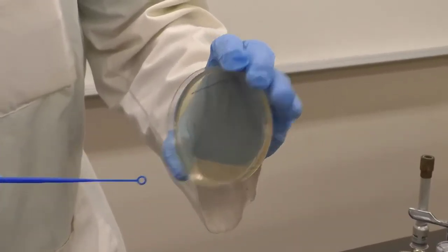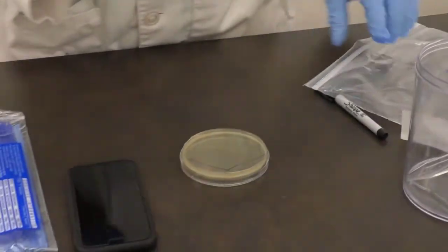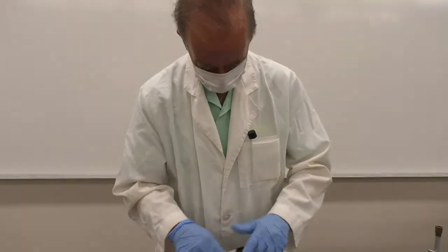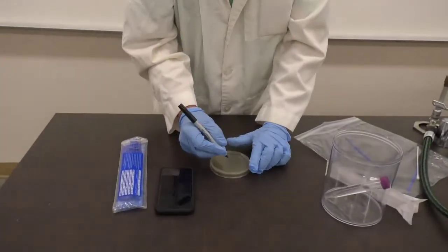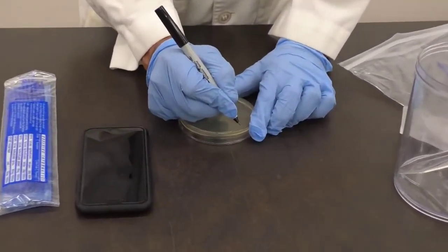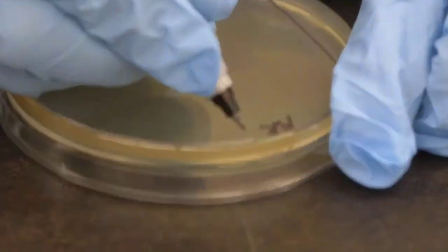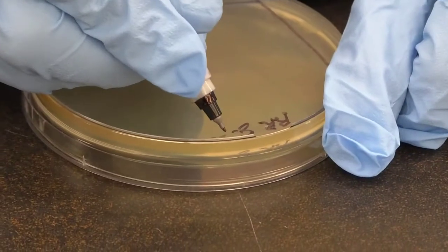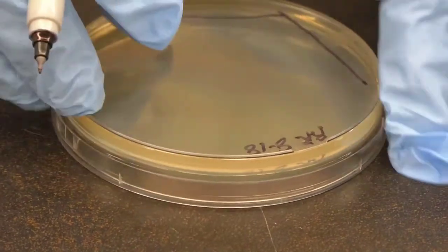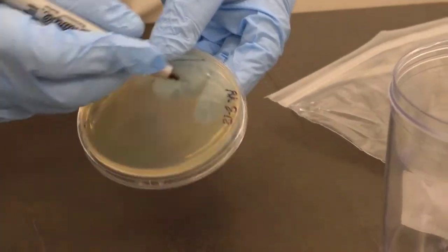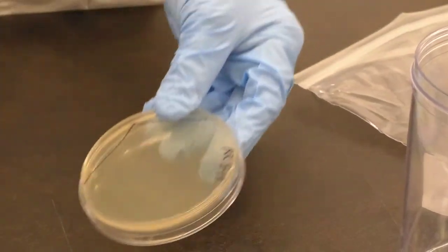All right, the other thing you always want to do is identify your plate with whatever you can. So I'm going to put my initials and the date. You notice how I wrote off to the side so as to not obscure what's growing on the plate. So always write to the side of the plate.